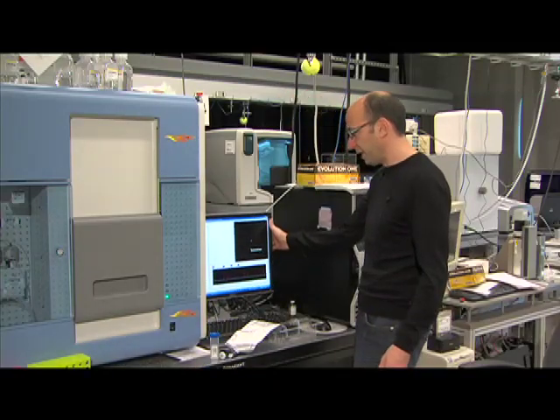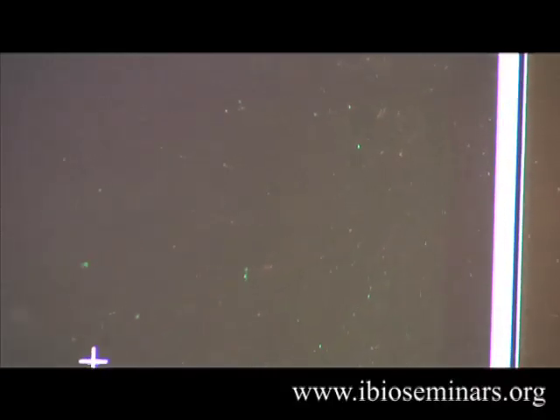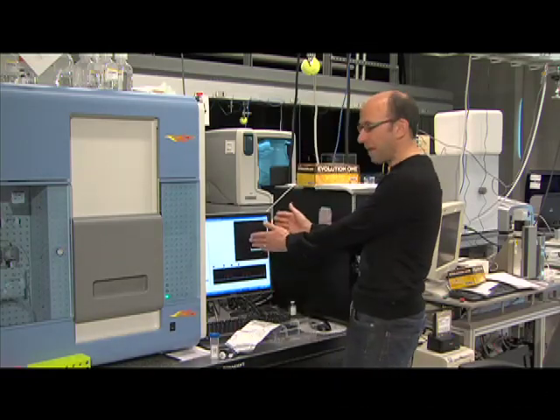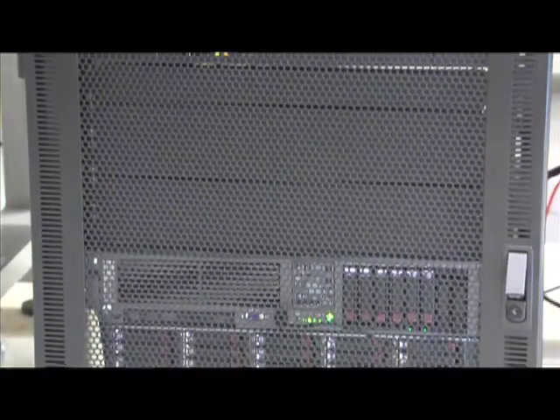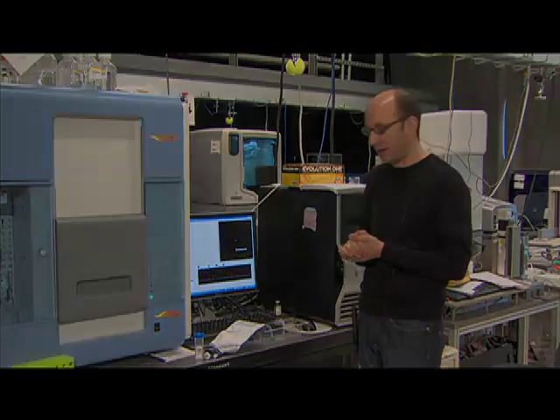And what you see here is a computer screen capturing one of these images. I'm sure these dots are barely perceptible, but each of these different spots is a different sequencing reaction. And so you can now imagine how with one small slide we're able to get many, many different sequencing reactions in parallel. The other important aspect, which you'll see down below here, is the computer that makes all of the processing and picking of these individual spots possible, because obviously you could never pull out the sequences from these spots by eye.